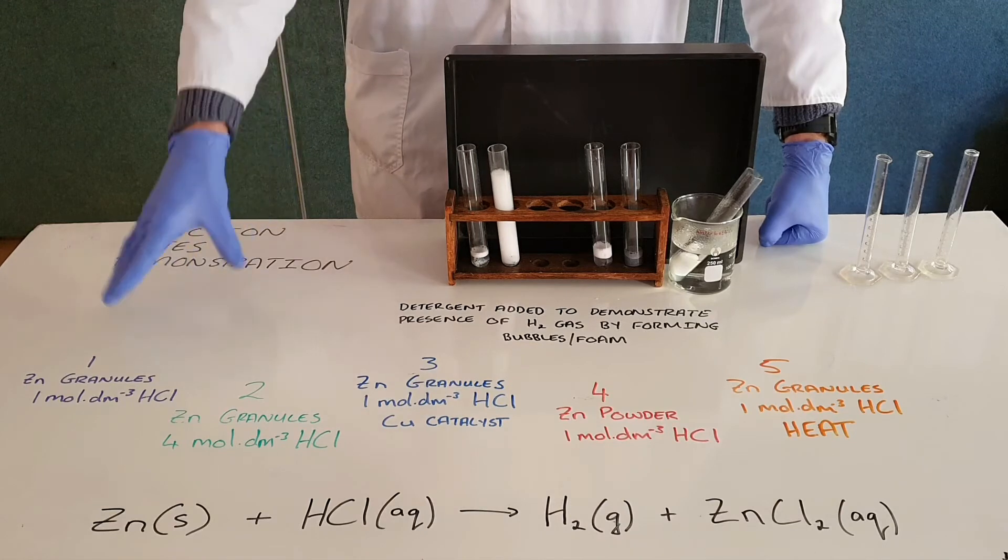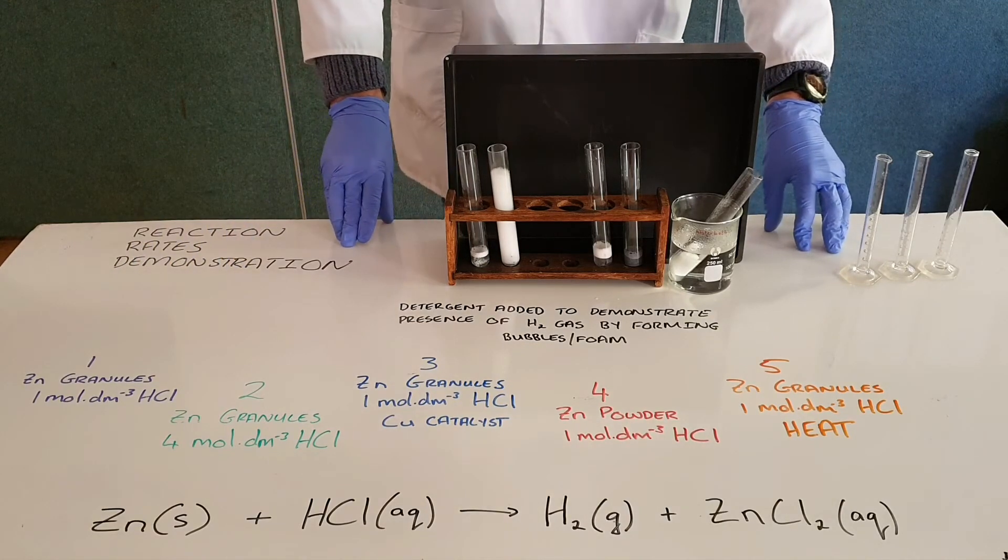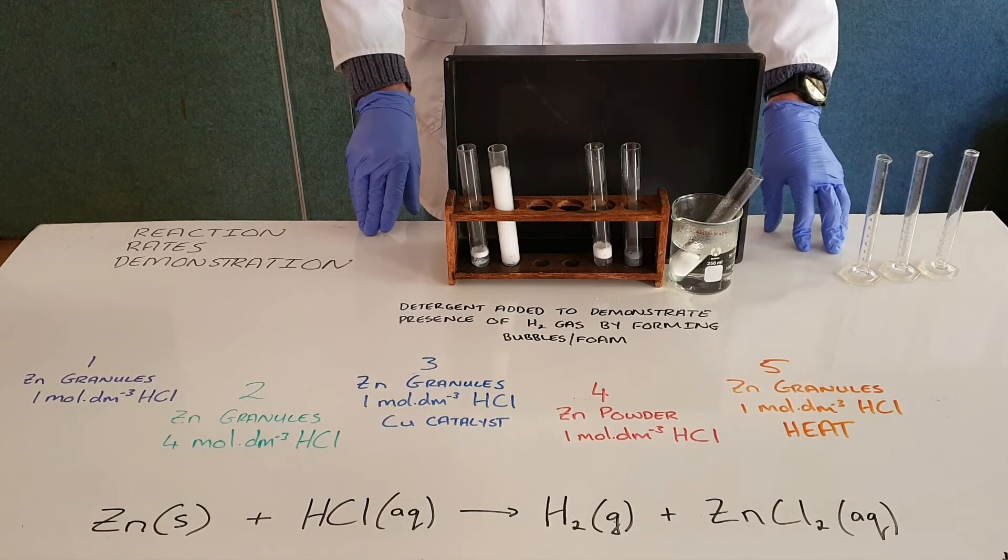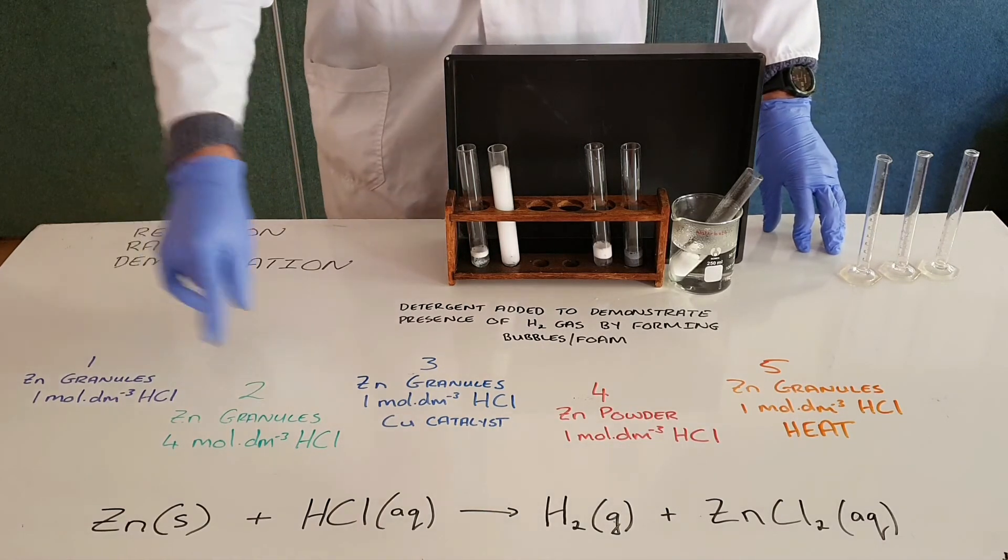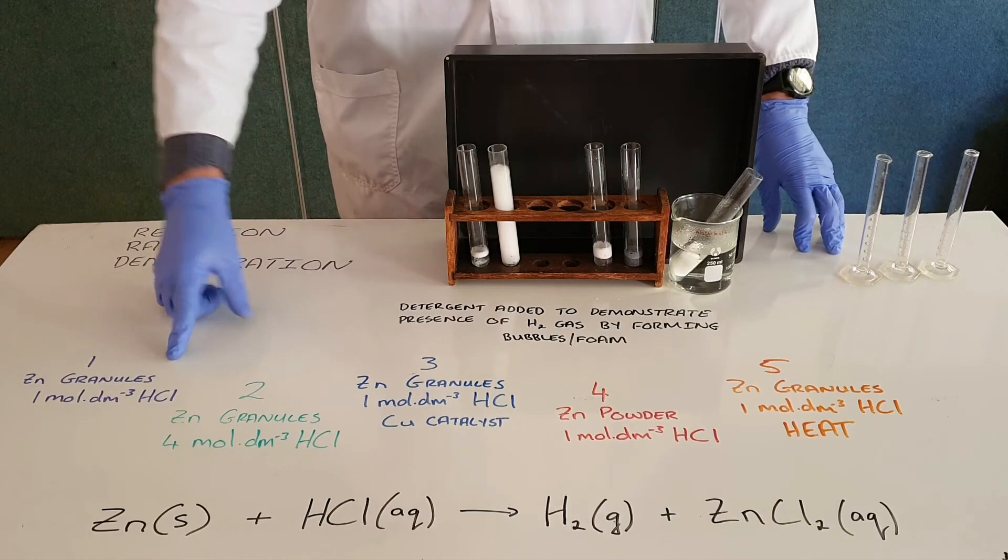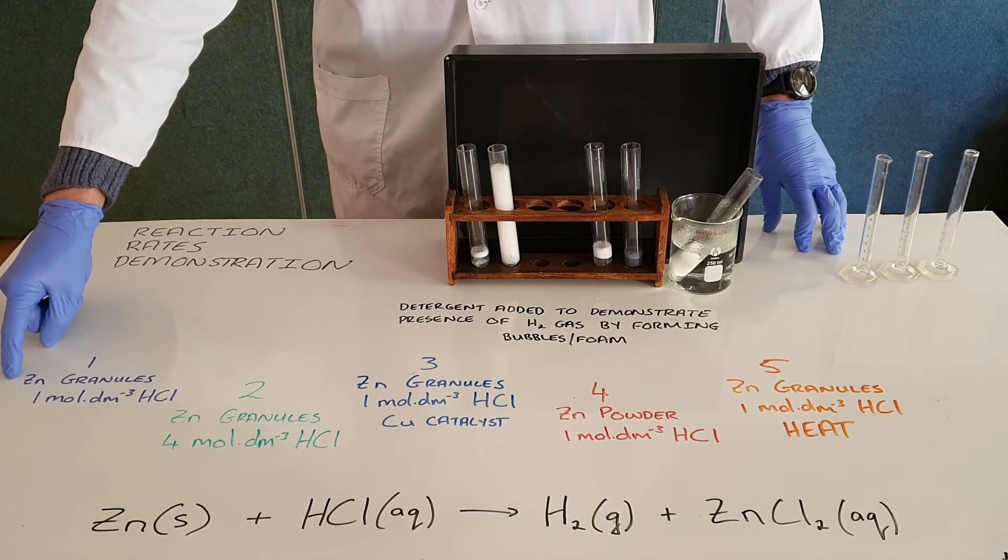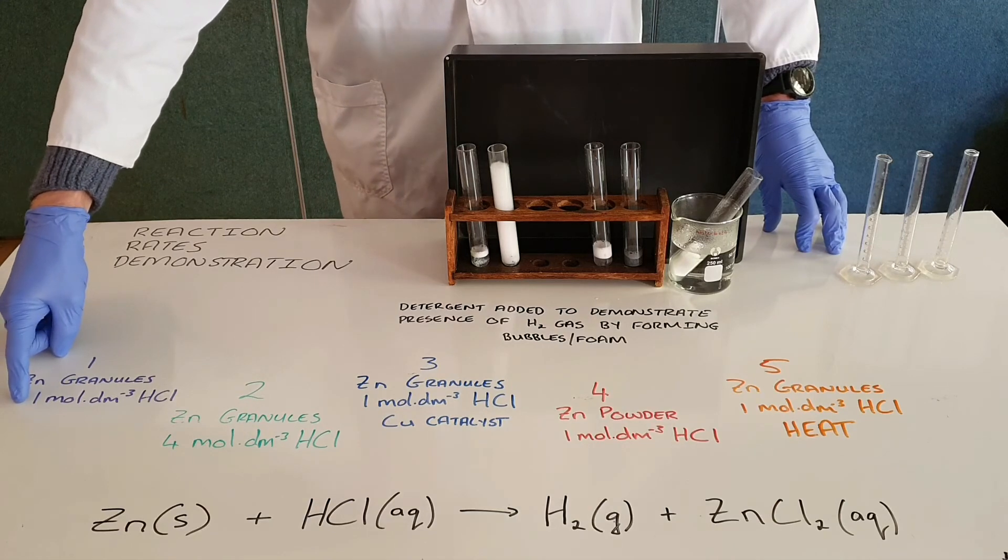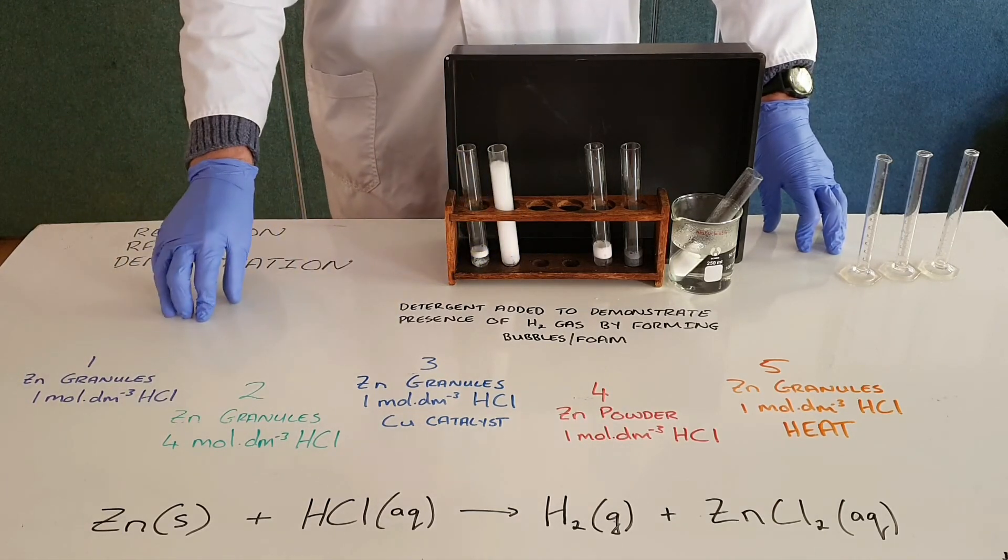So here we have a good layout of an experiment that allows us to compare the rates and the rate changes by different factors. Because we have used a constant in each experiment, we have either kept the surface area constant by using granules, or we have kept the concentration constant and only made one change to each test tube.